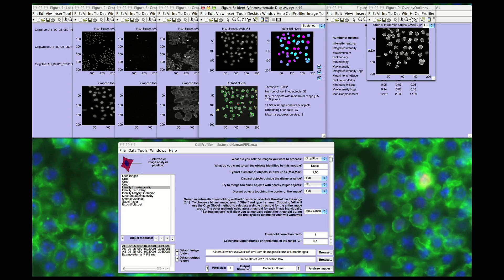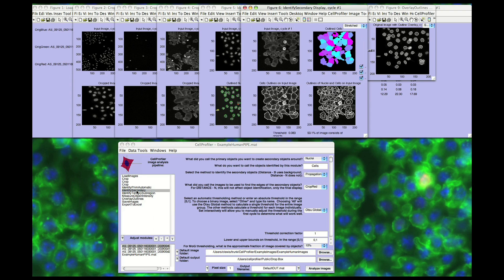After primary objects are identified, the edges of secondary objects that surround each primary object, such as cell edges, can be found more easily. We have implemented in Cell Profiler several robust methods for finding the borders between clumped cells.